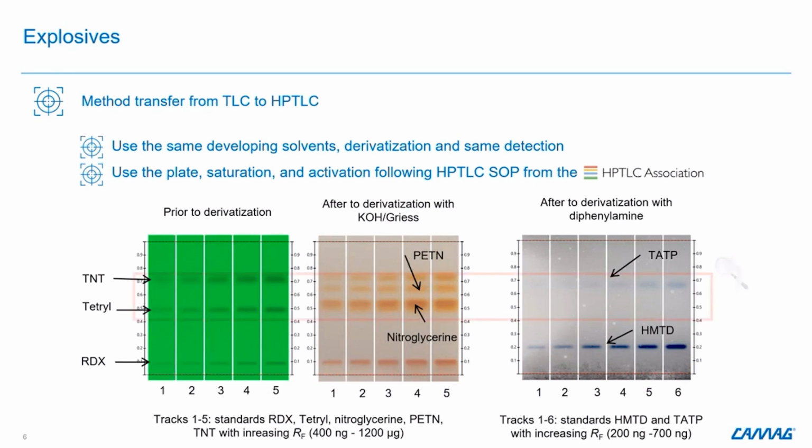So you see that we had a problem during our transfer of method. We see that the tetryl and the nitroglycerin are co-migrating, and the PETN and the TATP are also co-migrating. So the transfer of method was not easy.